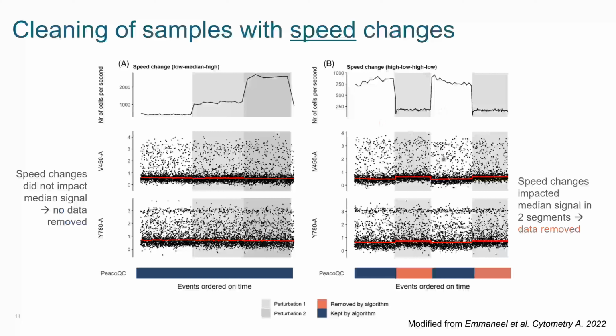And I suppose it has something to do with the way the rest of the run looks, right? So here, this might not be quite an even split. It could be that these are still the majority of the run in white, and there's a shorter perturbation period in gray. So I think it has more to do with the proportion of the rest of the run. And this is probably just an oversimplified schematic for display purposes.